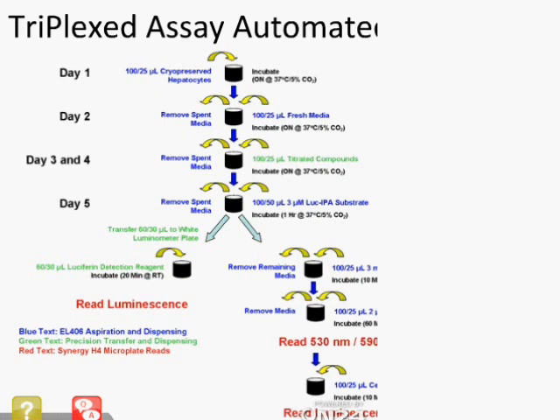You then have the addition of the CYP1A substrate, which in this case we used resorufin ethyl ether, with the addition of the salicylamide that's incubated. And then you have the fluorescent quantification of the resorufin that's created by the activity of CYP1A in the well. Following that read step, you have the addition of an equal volume of CellTiter-Glo, incubation, and then the luminescence signal again is quantified, which, as previously described, is proportional to the number of viable cells within the well.